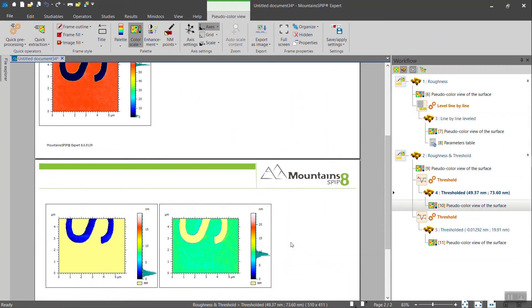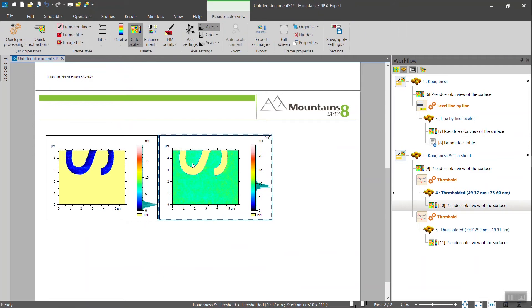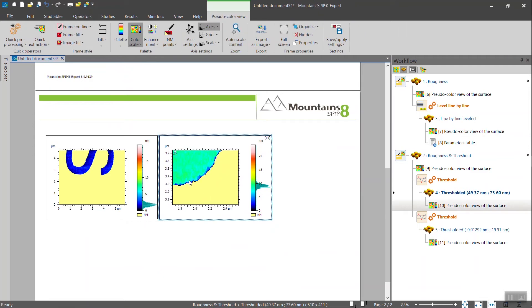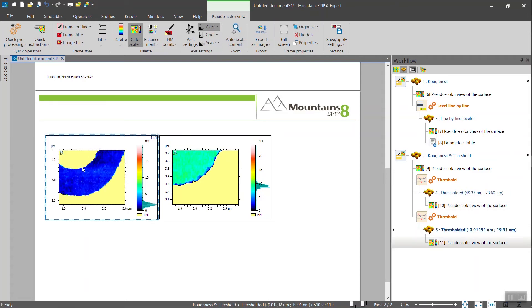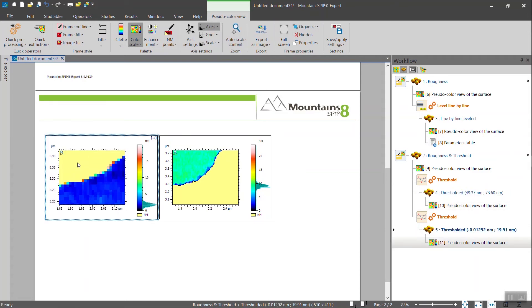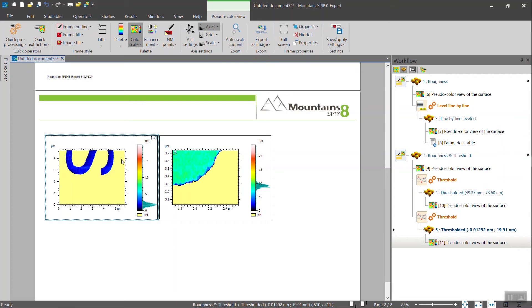Now, if you look closely, you will see that there's some effect on the edges. And it will have a consequence, an impact on the calculation, on the value. So you may want to erode slightly around those areas to remove these. And you may find the same thing here.